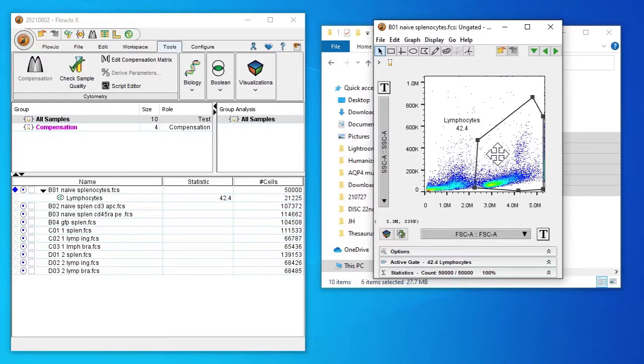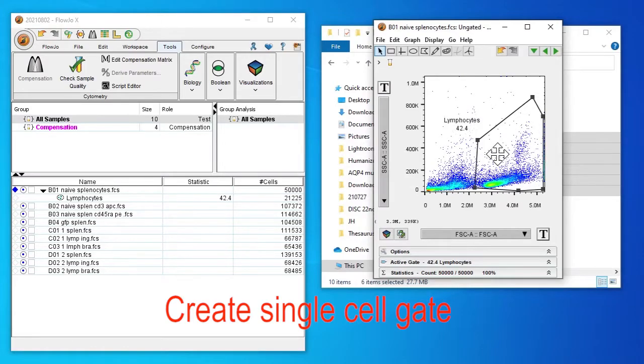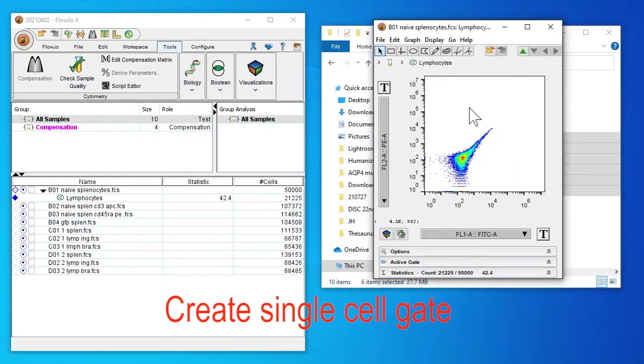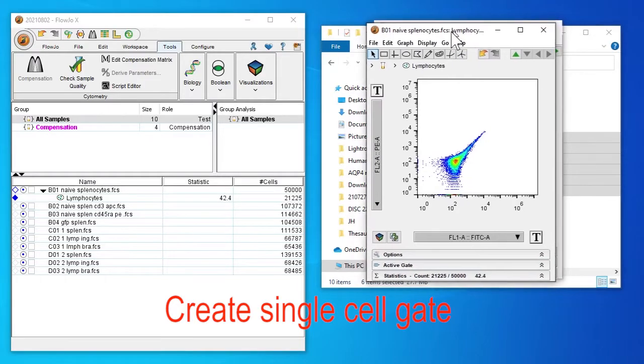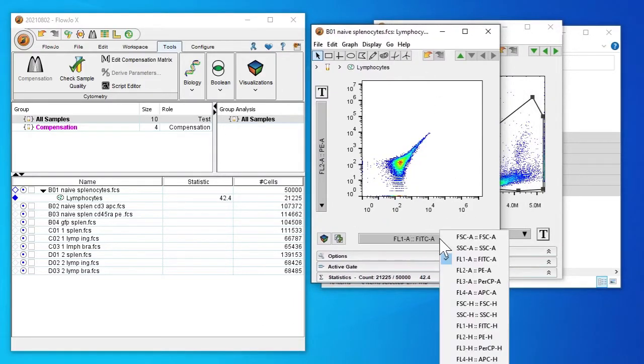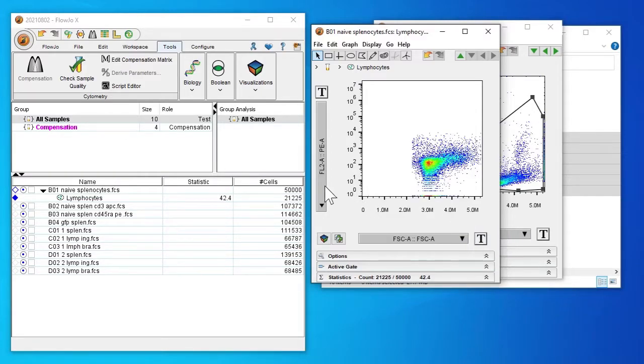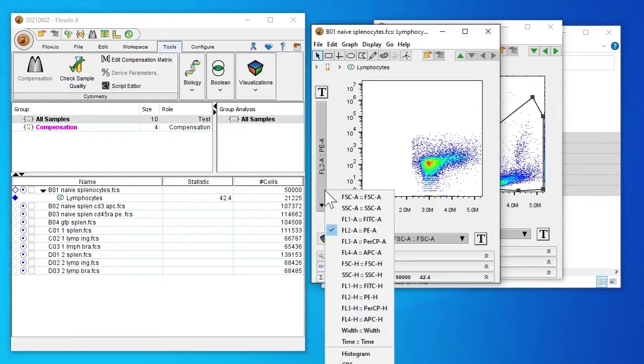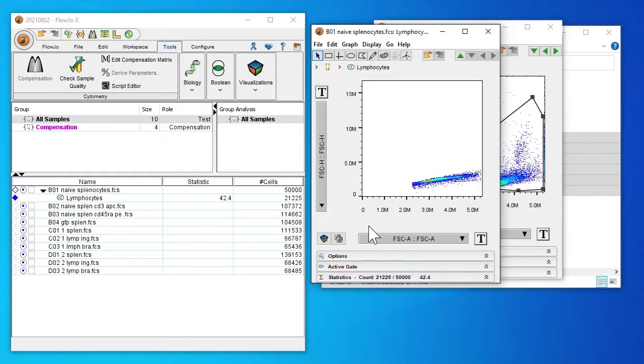Next I'm going to double click around gate to create a single cell gate. The x-axis will be forward scatter A area and y-axis will be forward scatter H height. Should see something like this.